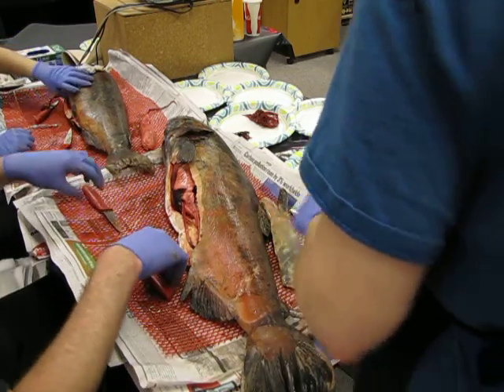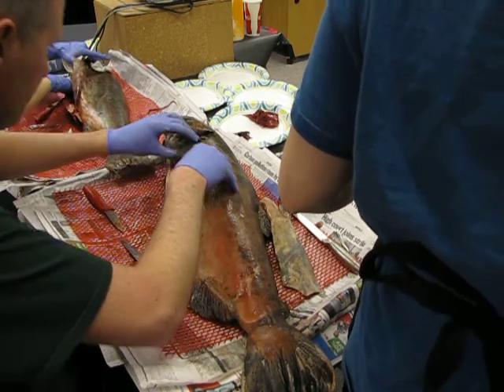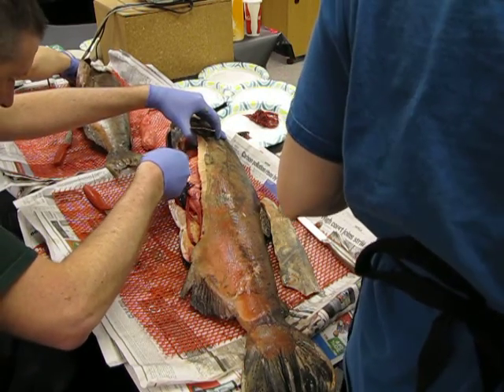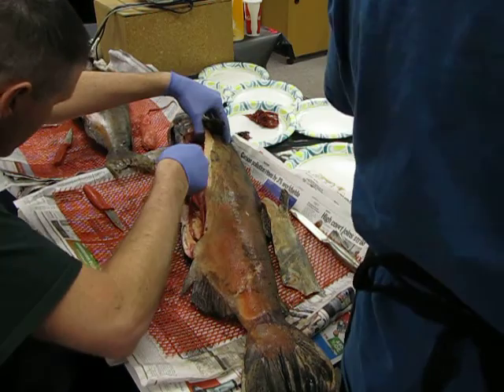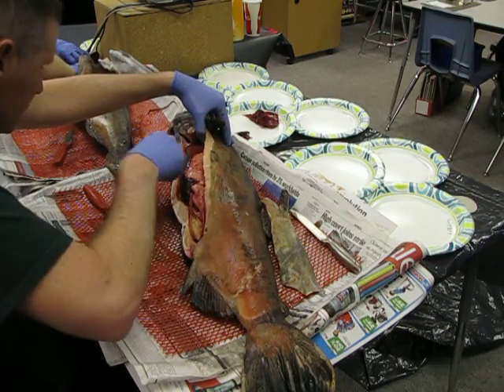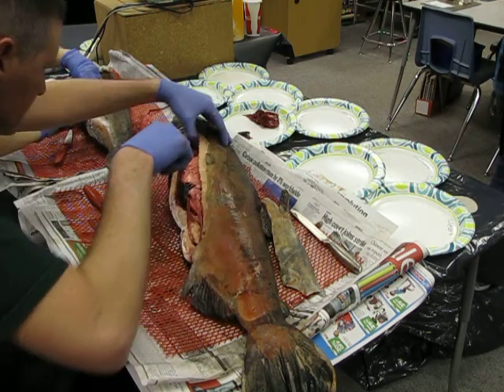Neat. Okay, so on the salmon's face. Now they don't breathe in air like we do. We smell through our nose, right? They have something between their eyes and the tip of their snout. Do you know what they're called? Gills. Well, they do have gills that help them breathe, but I'm talking about something that helps them smell.